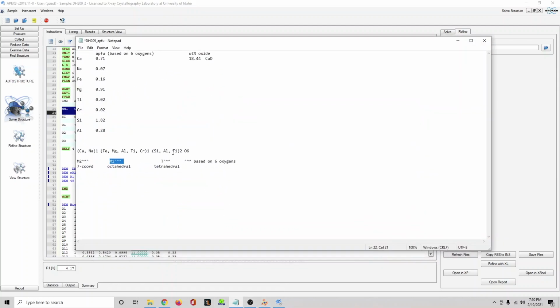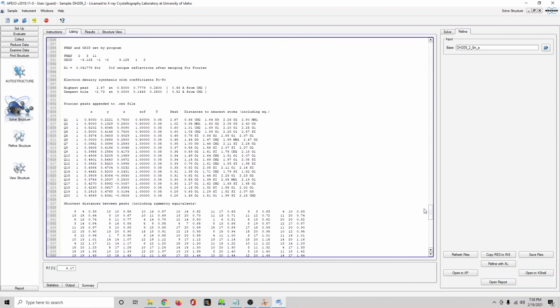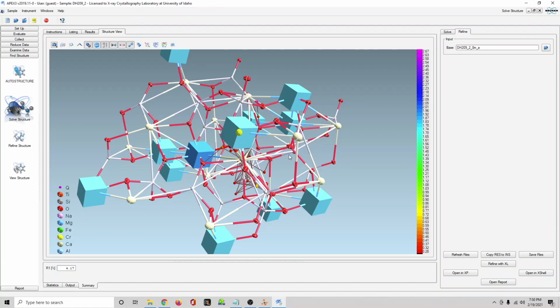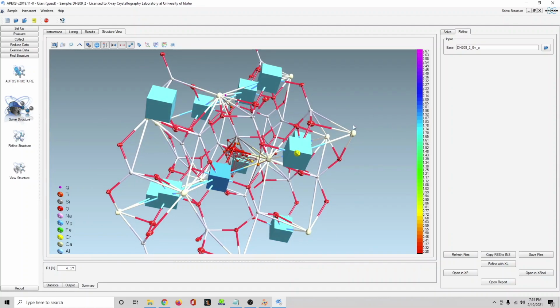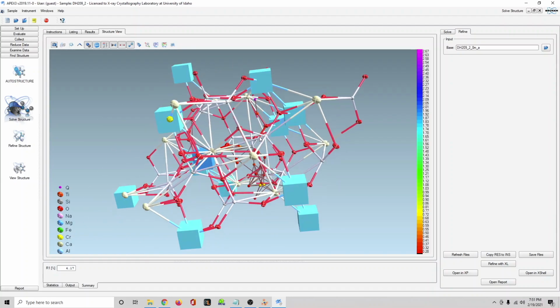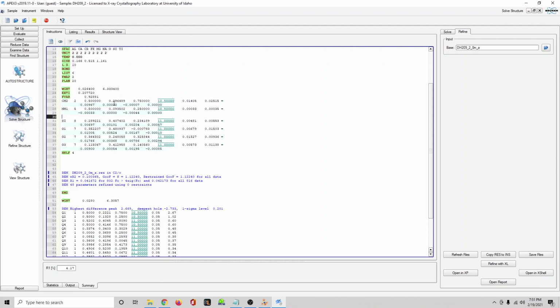First of all, based on the chemical analysis. Second, this is a natural occurrence of a mineral, and that always happens. Iron and magnesium always substitute for each other in most settings geologically. And third, I'm sure there's some way of checking those differences in the electron density. So that would be this position, which appears as a box because it's not well modeled on the ellipsoid plot. The atomic displacement is non-positive definite, which could be because of the fact that it's split between different atoms in part. So I'm going to just split that site between two. I mean, it's not splitting the site, it's just chemical substitution. I should make the distinction there.